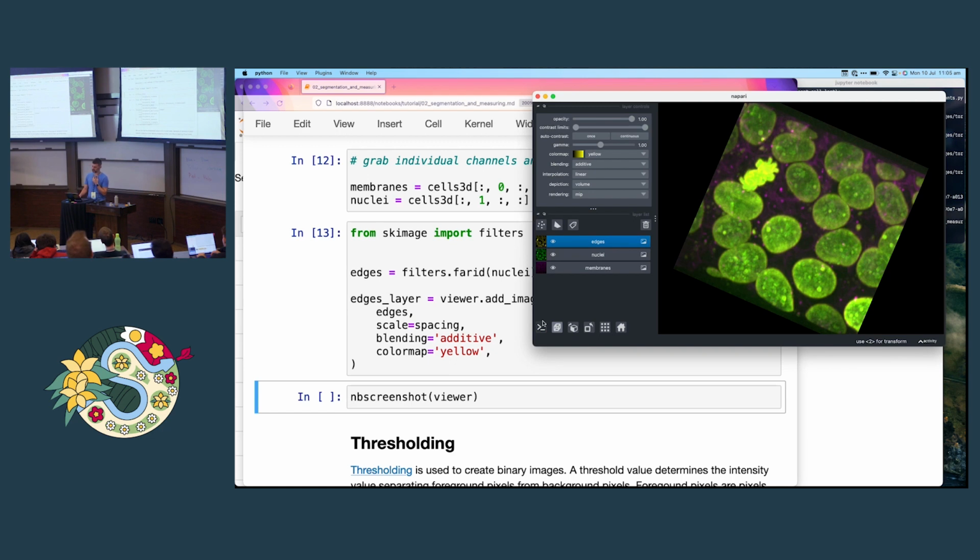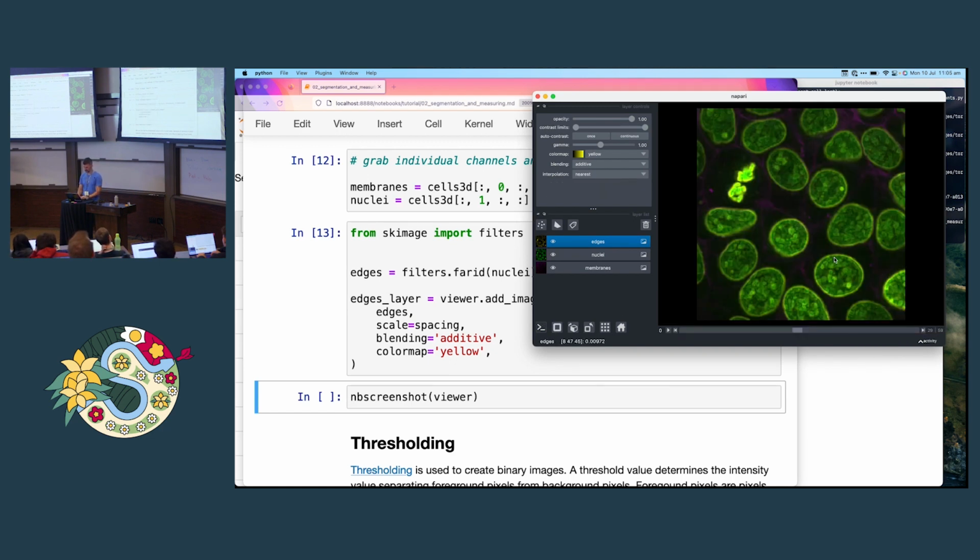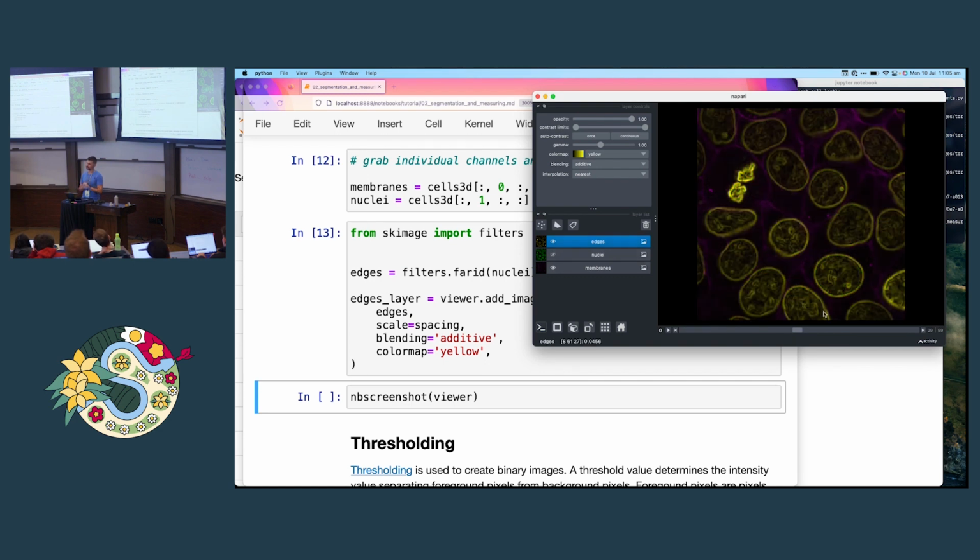Yeah, so then you can see all of the different thresholding methods, and you could just pick a random one and do a question mark and see what that method is all about. So typically, depending on what your data looks like, you might want to use one or another. And in this case, we've just chosen threshold more or less arbitrarily.